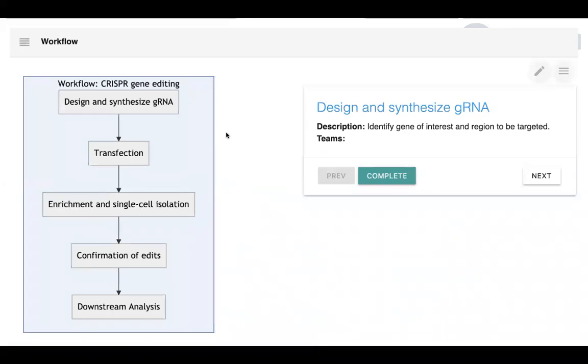And then many of the workflows that I showed you today will be pre-configured, which means in the future, maybe within this month, it will be available to you. You guys just need to install it. And then you are able to use this kind of workflow directly inside the system.